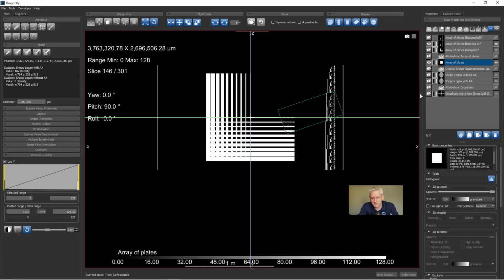If you're ever doing any correlative imaging and you want to resample the image from one experiment, like a light micrograph, into the spatial domain of another experiment like SEM, this is how you would do it. So all of these ideas could really come together in a correlative imaging tutorial. If anyone has some data sets they want to share and use to demonstrate that, I'm happy to get into that and drive home these tools.